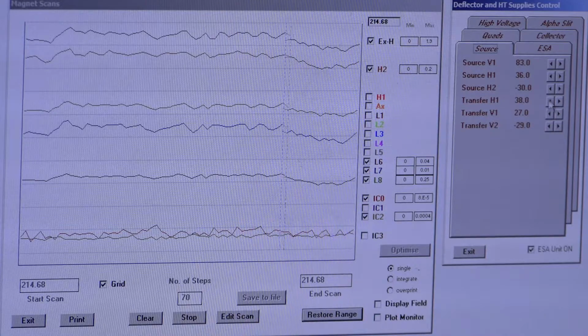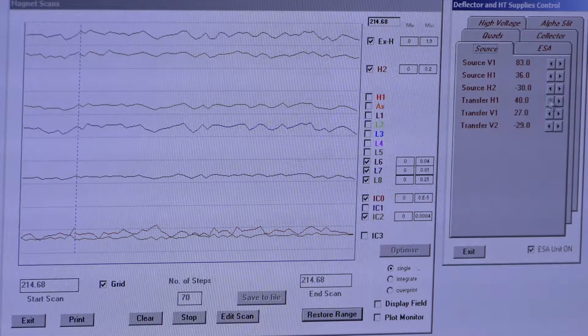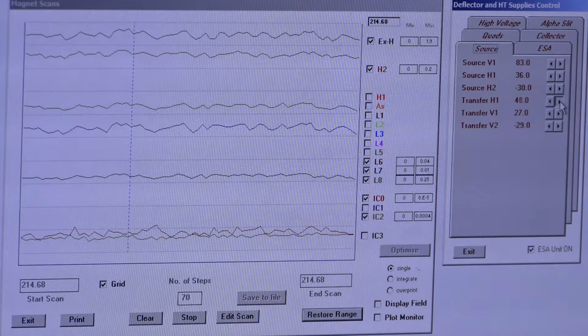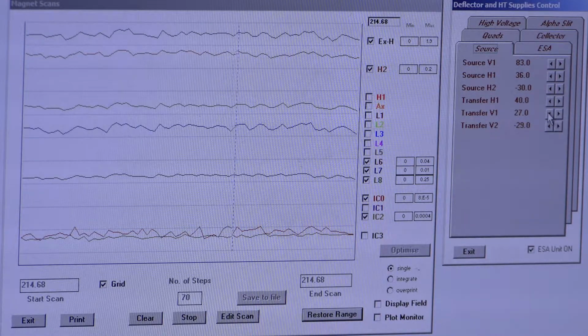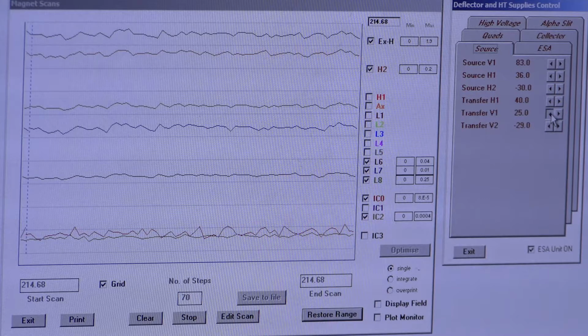And that's a really great learning technique that you could try as you're learning how to tune and getting a feel for the new. It's something I had to do just to get things locked in. So don't feel like it's redundant. It's not. It's always good to see how changes you're making are affecting the instrument.